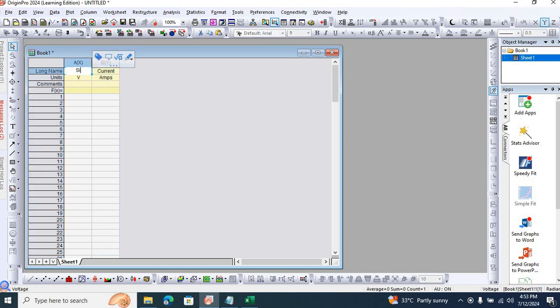Here I'm going to change the labels. I am looking at SIMS concentration, and the x-axis is the depth, and on the y-axis I am looking at the SIMS concentration. The unit of depth is micrometer.